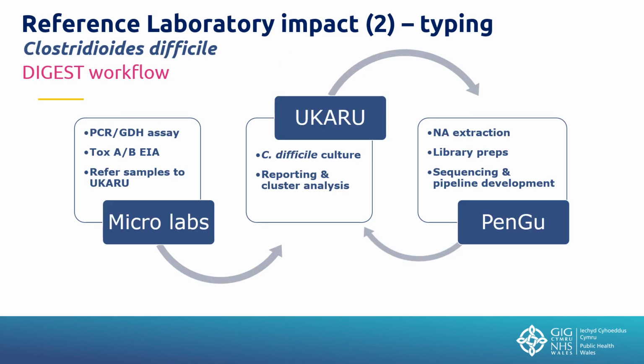In terms of the impact of typing within the Anaerobe Reference Laboratory, we have moved on from using PCR ribotyping to using whole genome sequencing for our Clostridioides difficile strains that we culture from across Wales, and this process is highlighted in this diagram here.